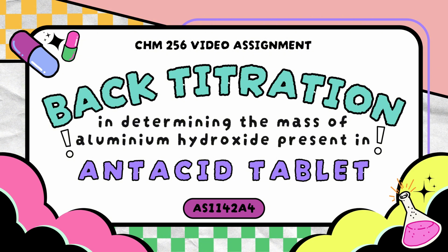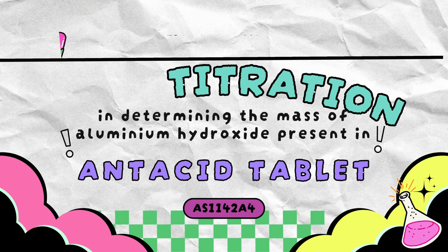In this video, my friend and I want to explain about the application of back titration in determining the mass of aluminium hydroxide that is present in antacid tablet.